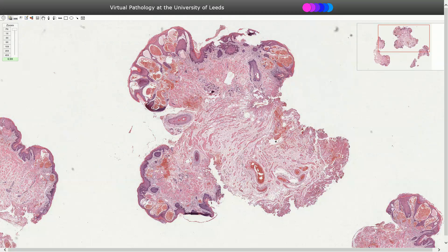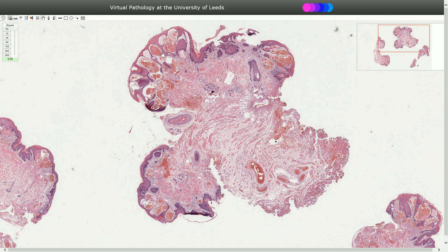Angiokeratoma is a skin lesion characterized by ectatic superficial dermal blood vessels associated with reactive epidermal hyperplasia. Angiokeratoma can be solitary or multiple and we can see them usually on extremities. Some subtypes of angiokeratoma can be seen among elderly men on the scrotum, as in this case.